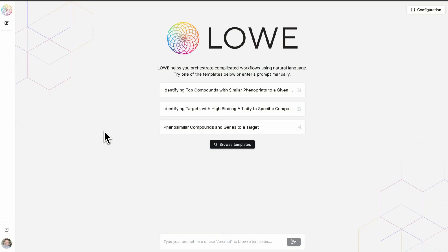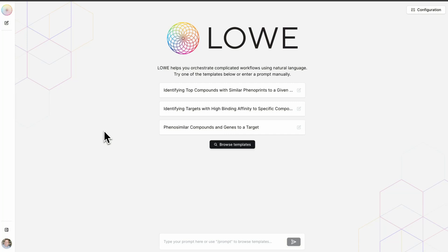Lowe was built by the team at Recursion's Valence Labs to put the power of the rapidly evolving Recursion OS at the fingertips of our scientists. Its core strength lies in its remarkable ability to orchestrate complex workflows of computational tools, experiment design and scheduling tools, and even processes leveraging third-party tools such as compound ordering.